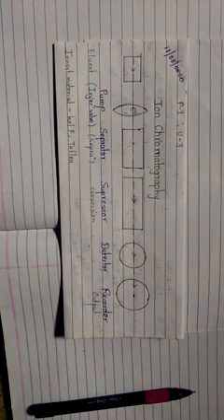In the suppressor column, for cation and anion, the eluent from the column is once again passed on the suppressor column, leading to the elution of anion or cation as the case may be, giving a good signal by using the eluent respective to cation or anion.